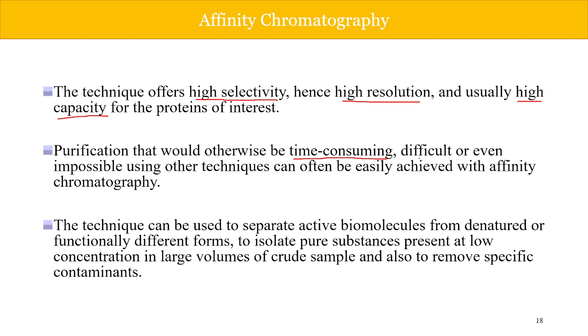This chromatography also helps when your proteins have affinity for a particular thing. That thing can be used to make up your column, and it will help your protein to get attached to that column, and then you can actually purify it. So if it is not possible using any other technique, we can use this.